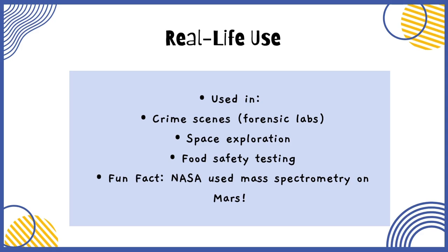In real life, we use this in crime scenes, forensic labs, space exploration, and food safety testing.